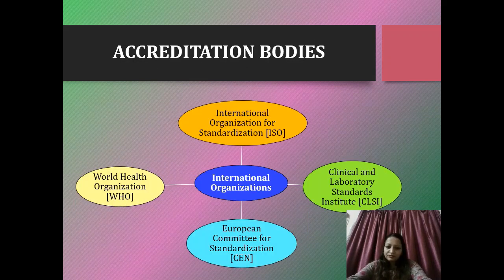So there are many accreditation bodies. The most popular ones are the International Organization for Standardization, or the ISO, the Clinical and Laboratory Standards Institute, or the CLSI, the European Committee for Standardization, and the World Health Organization, only to name a few.